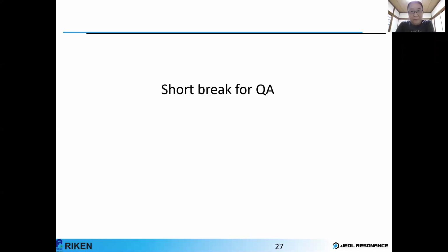Okay. From my personal experience, if we are working on the MQMAS experiment, I think we should use a slightly larger rotor, like a 2 millimeter or 3.2 millimeter rotor, because yes, we can achieve a very strong RF field if we use very tiny rotors, but that also sacrifices the sensitivity. And in the MQMAS experiment, we directly observe the signal, so the sample volume is very important. So in the case of MQMAS, I think 2 millimeter or 3.2 can be a good option. This is the compromise between RF field strength and sample volume.